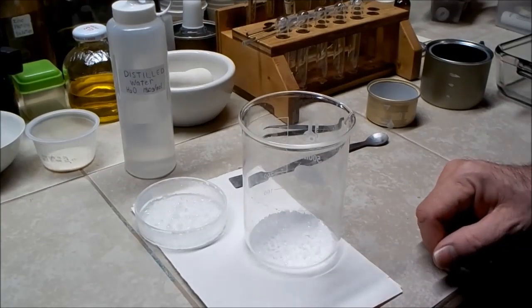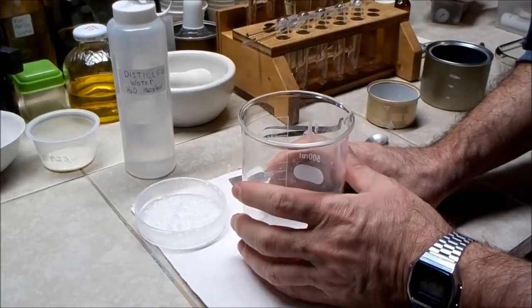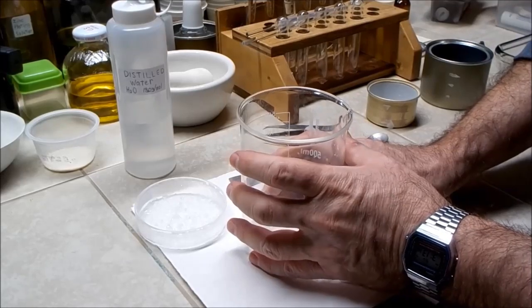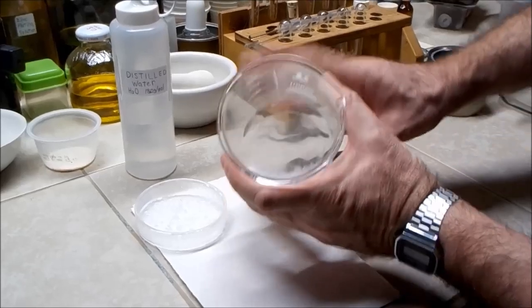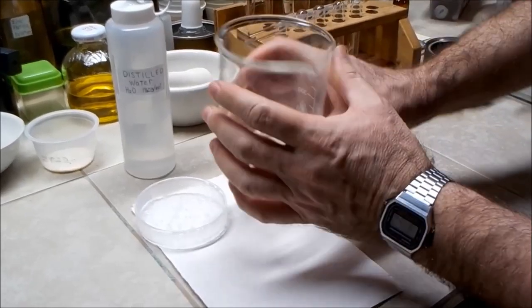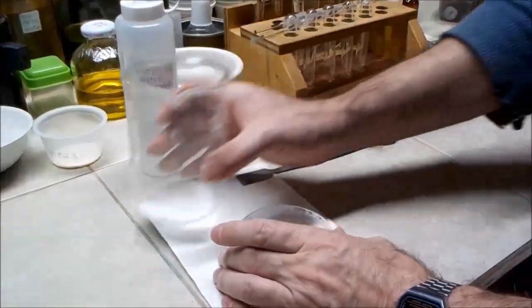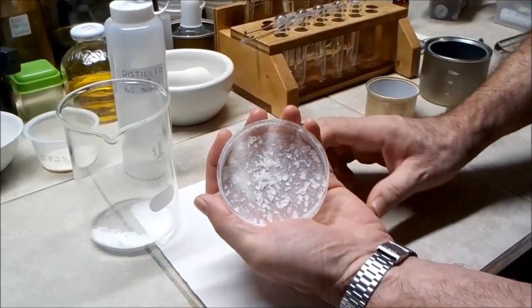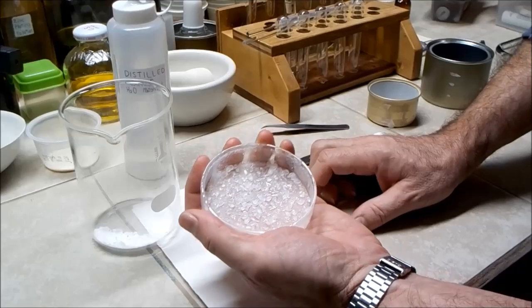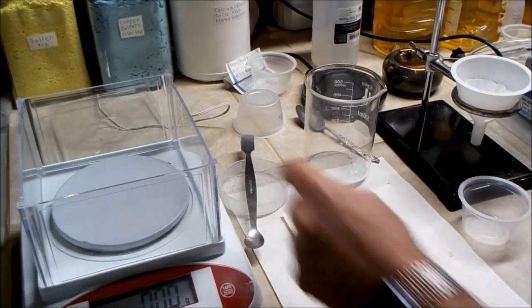Several days later and I changed my mind. After it cooled down I noticed there were some fairly nice crystals that formed in the bottom of the beaker, so I decanted the liquid off and let the crystals dry. I poured out the liquid into a dish and it has since evaporated and left behind some nice crystals as well. I'll be saving these as is. I scraped the crystals out of the dish.